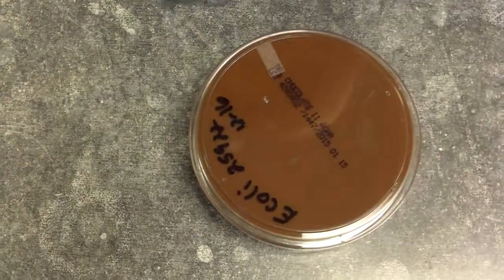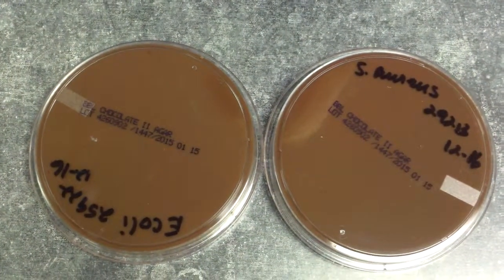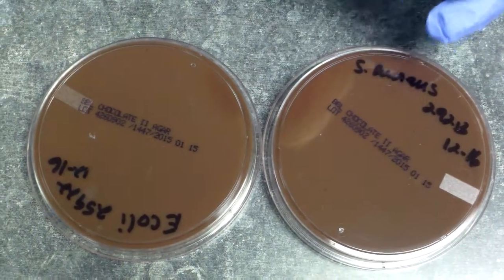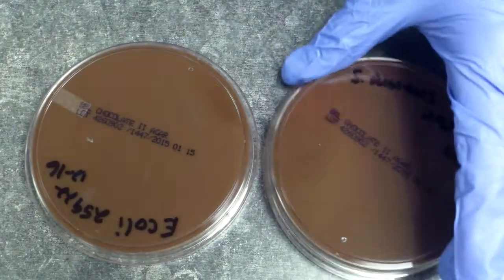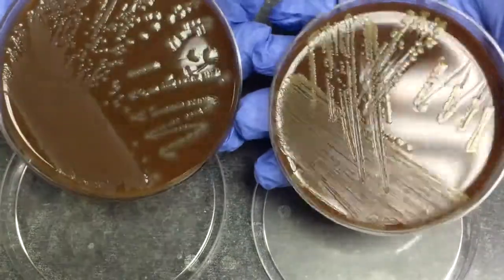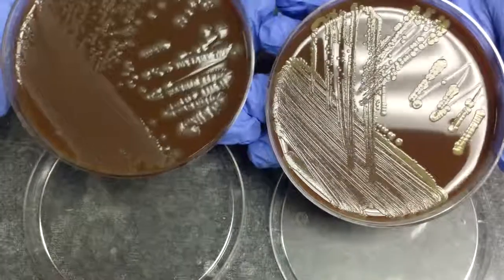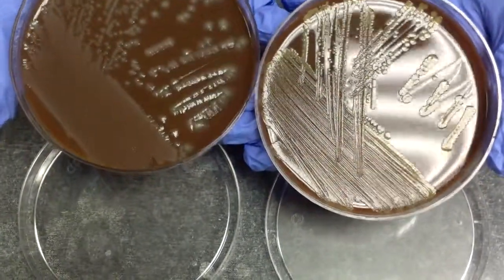The next category of media is our enrichment media, and chocolate agar is considered an enrichment media. Chocolate agar is red blood cells that have been lysed and then incorporated into the molten tryptic soy agar, and will then have X and V factors, which help the fastidious organisms to grow. And as you can see, we have a Staph aureus and an E. coli, so it does not inhibit any growth. It allows and enhances growth of most organisms.